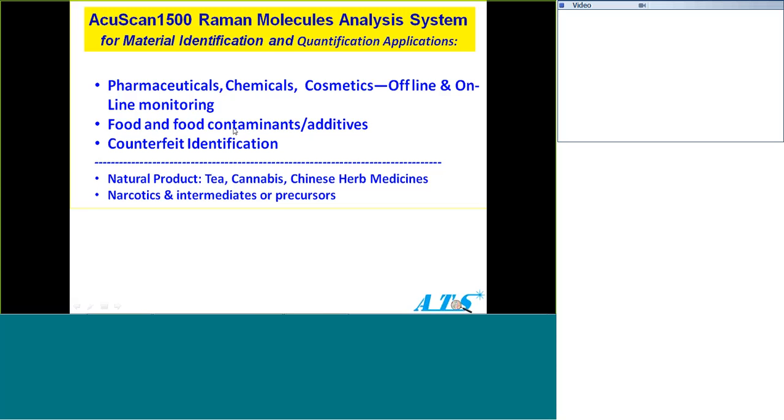Or the program itself allows you to calibrate against your own sample, say toluene. In our software we give you an example, IPA, isopropyl alcohol, which has about 9 peaks. We have standard pixel-to-wave-number values, compare with that, and adjust the pixel against the wave number. Then it calibrates to the absolute same number, so you produce the same spectrum every time. This is one way we do the calibration.